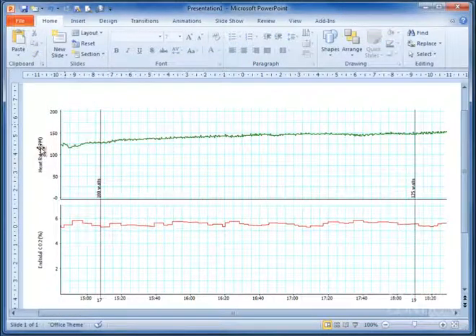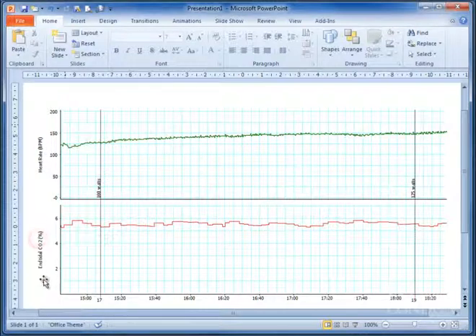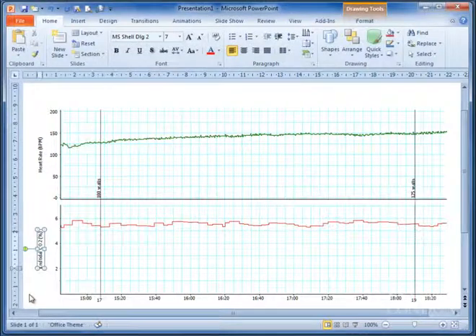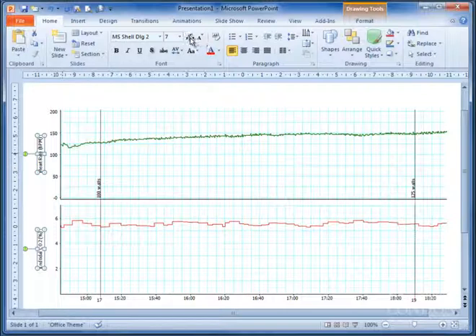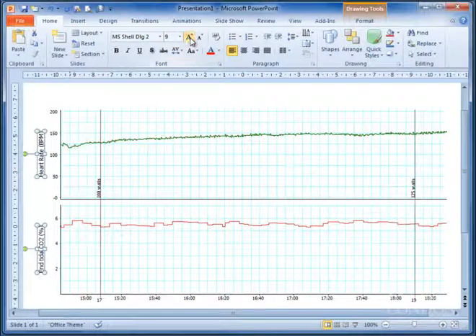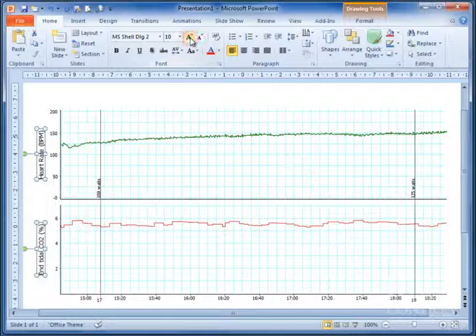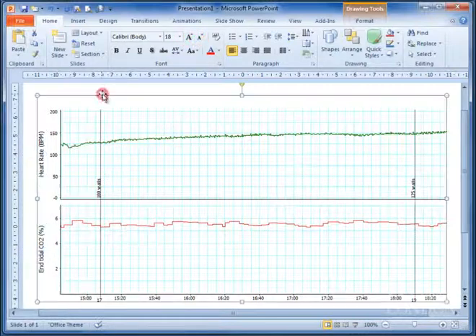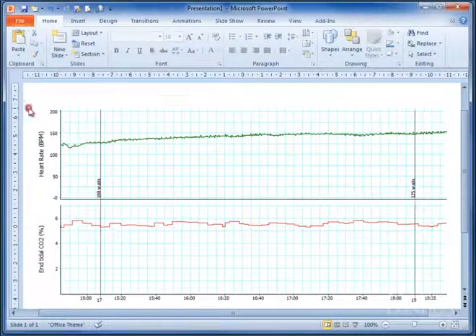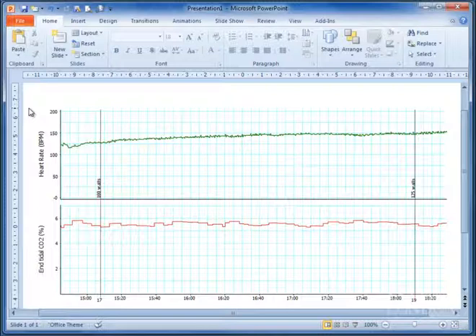We may want the heart rate and the end tidal CO2 to be slightly bigger. So we can select both of those, and we can use PowerPoint to increase the font size. That's about right. So that's increased the font size there. That looks nice. I'm quite pleased with that.